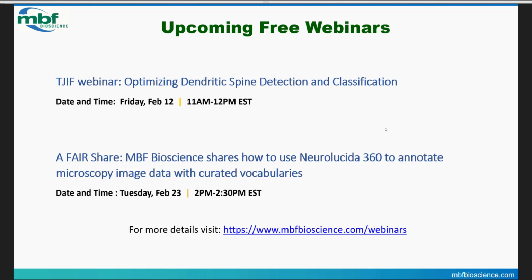A lot of questions about modality, whether it's Nissl, NeuN, DAPI, and I answered that partially in text, but do either of you want to talk to that? Brian and I talked about it a little bit already. Originally, the modality used in the Allen coordinate space is the two-photon image. What we've found is that we can use DAPI. Fluorescent Nissl, DAPI, and other modalities actually do work fairly well with the two-photon atlas.